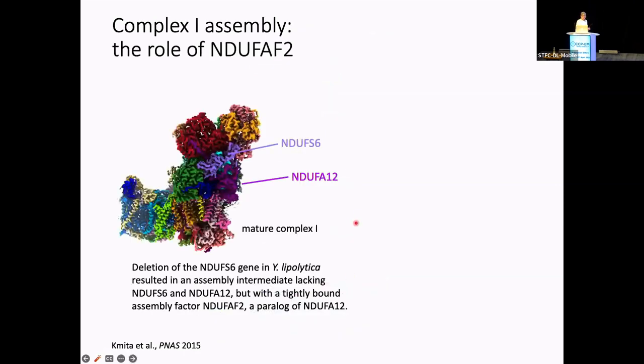And for that, we have to look at another bit of work that was inspired by a study a couple of years ago by Volker Ziekermann's group, where they looked at the S6 subunit, shown here in light purple. So it is known that mutations in this subunit cause lethal problems. So complex 1 does not work anymore.